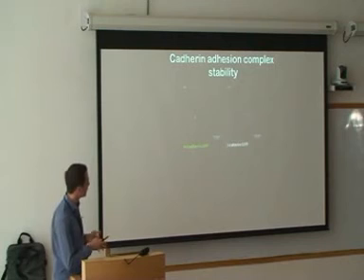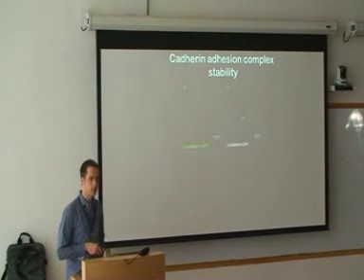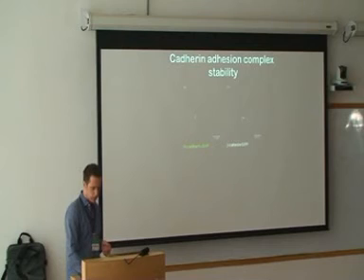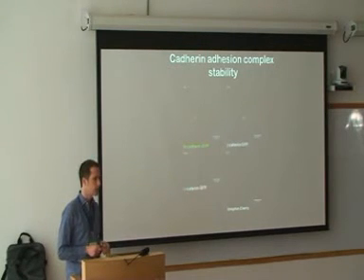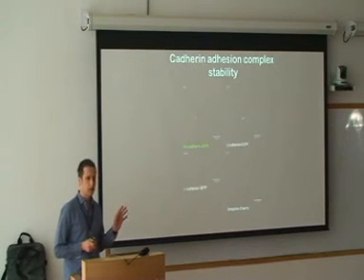If you look at beta-catenin, and again, it's not visible for you, beta-catenin localizes somewhere here. You're pulling on these cells, you're pulling them apart. There's one cell, there's another cell, a plasma membrane tether. And in the middle of this tether, this would be the border of one cell, you have all beta-catenin pulled in. So basically, somewhere it ruptures downstream of beta-catenin as well. When we look then at alpha-catenin and at actin, and this is all invisible for you, then we don't see alpha-catenin flowing into these tethers and actin flowing into these tethers. Basically, the adhesion complex apparently has its weakest link between beta-catenin and alpha-catenin.